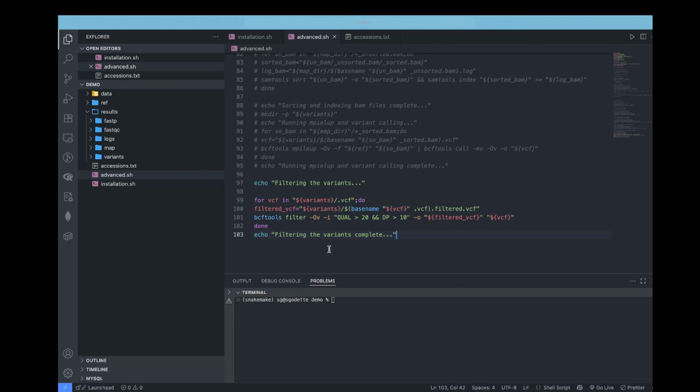So we want to counter-check our script to make sure that it is correctly written. And you can see here that we made a few mistakes. For example, this should not be here. It should be there. And also make sure that you put the asterisk there. And now, since we are much more sure about our program, we can rerun the file again.